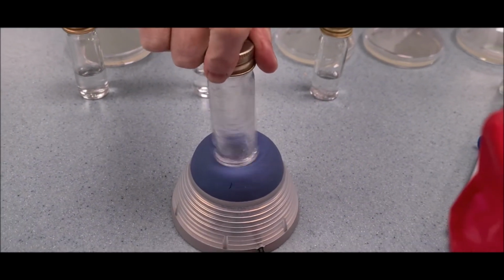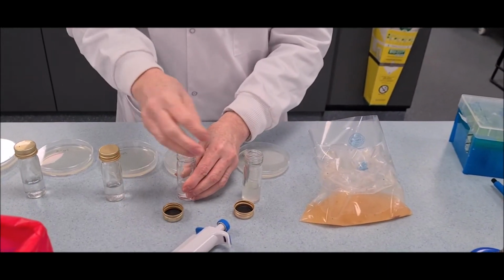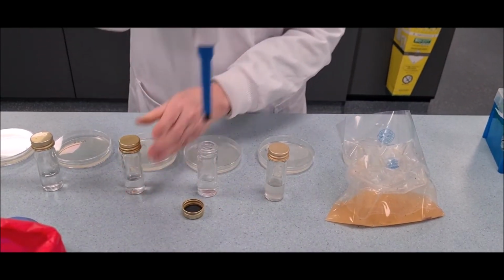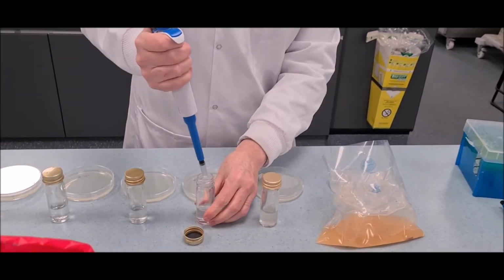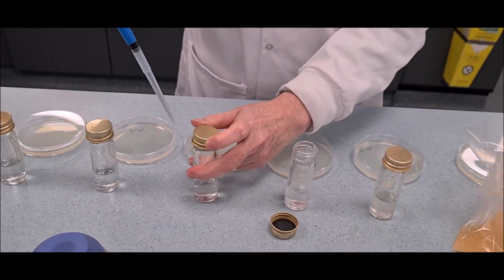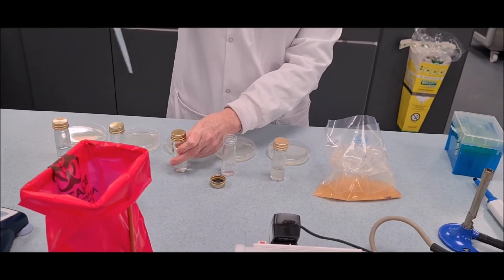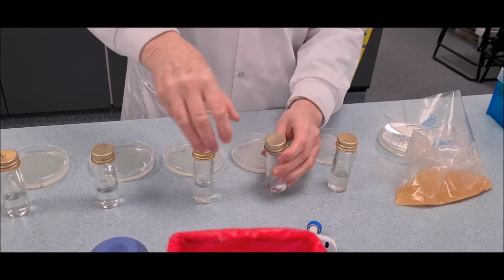Open the cap and flame the neck of the bottle. Using a fresh tip, transfer 1 milliliter or 1000 microliter from the second dilution bottle to the third dilution bottle. This gives us a dilution level of 10^-4. Replace the cap, flaming and mixing as before. Repeat for the rest of the series.